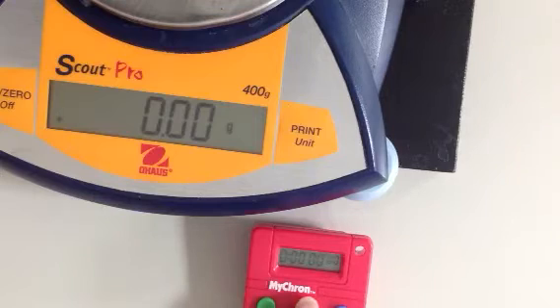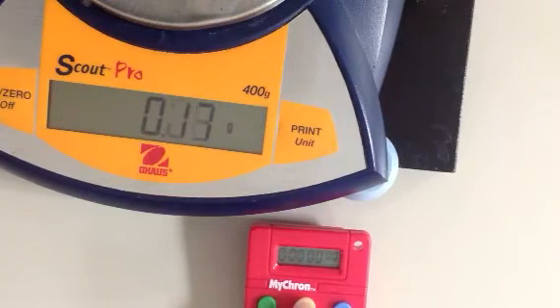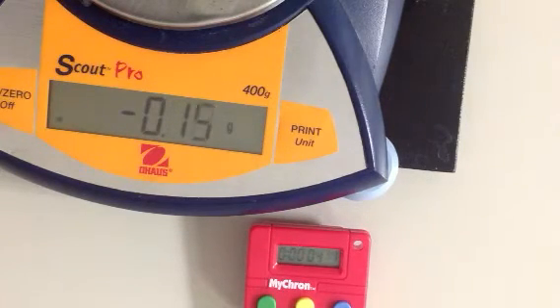Okay, is it still in the screen? We can still see it up there? Yes. Right, here we go. Okay, so you can see the reaction occurring in here. And look at the mass. The gas.